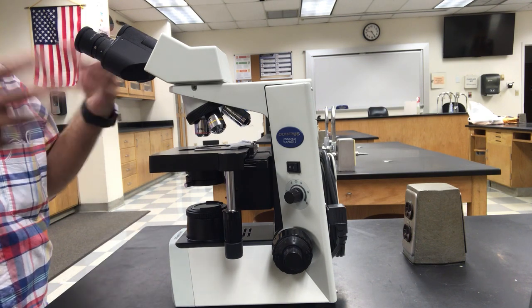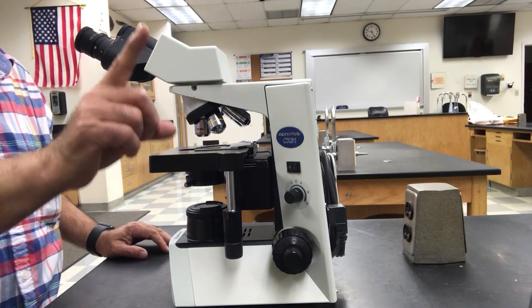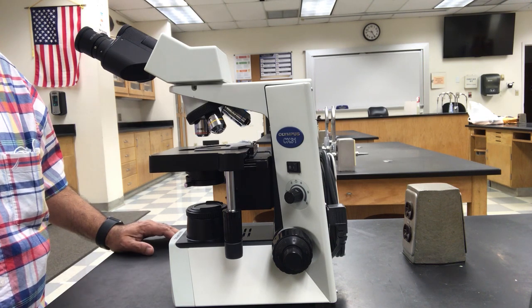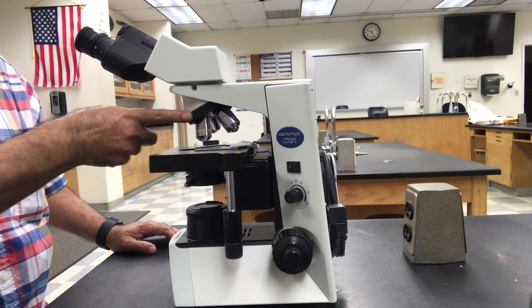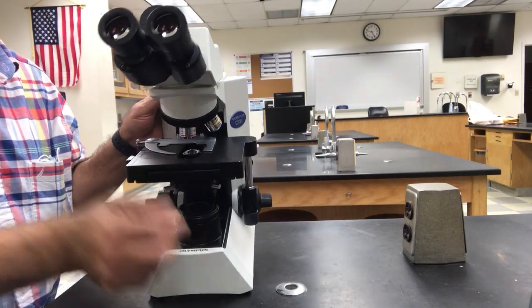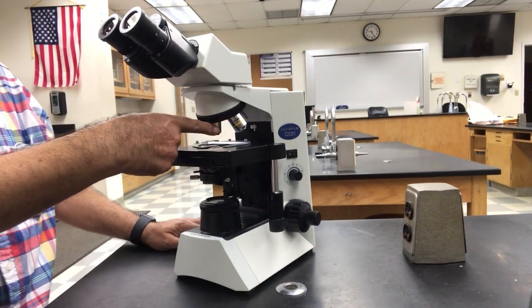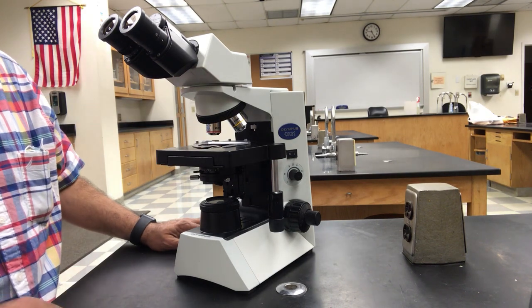The simple type, if you have seen in pictures or you have one or you have used one, would have only one lens. We won't go into that. We need this one. This is called a compound microscope because it has two sets of lenses. I hope you can see the two sets of lenses. One is the ocular lens. This is where you put your eyes. And the other one, the objective lens, this is where you put the object, which is a slide.